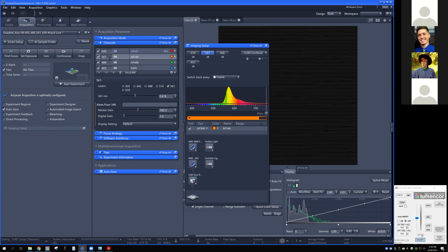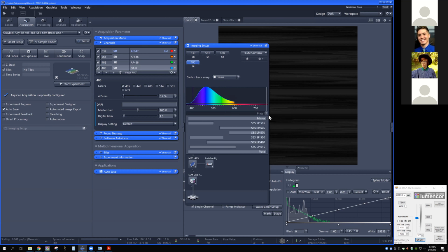All right. And from here, then what we can do is work with a couple of different combinations of the plate and everything else. So I'm going to start, let's say, with the 405. And I could do something like a short pass 505 that would actually work pretty nicely with everything, honestly. So this might be the easiest way that I could set this up here.